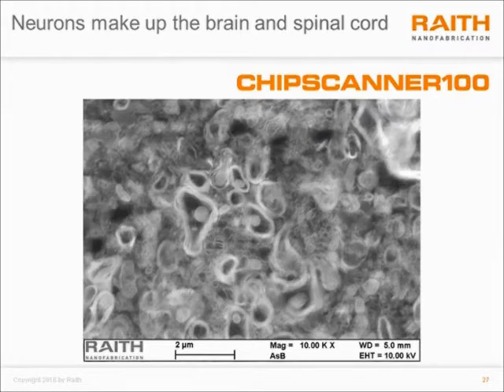And here we have an image of neuronal tissue that has been stained with osmium tetroxide and also uranyl acetate in order to produce very good contrast for the myelinated walls here, as well as the neuronal cell. The sub-ultrastructure can be clearly resolved at very high resolution with this scanning electron microscope.